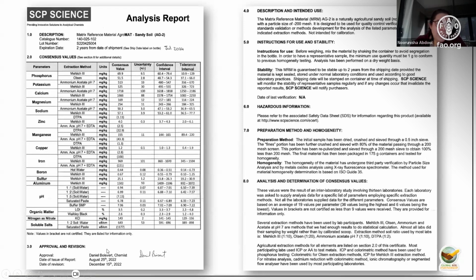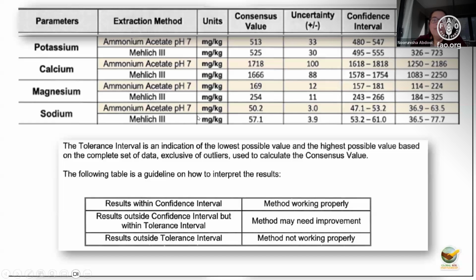And then obviously very important, does this actually pass? This gives you a mass amount of information. You'll see that they've done different extracts here on these samples. So I'm going to talk you through it. The bit that we're looking for the most, because we're looking at cations in this example, potassium, calcium, magnesium, sodium, they do not do sulfur in an ammonium acetate extract.